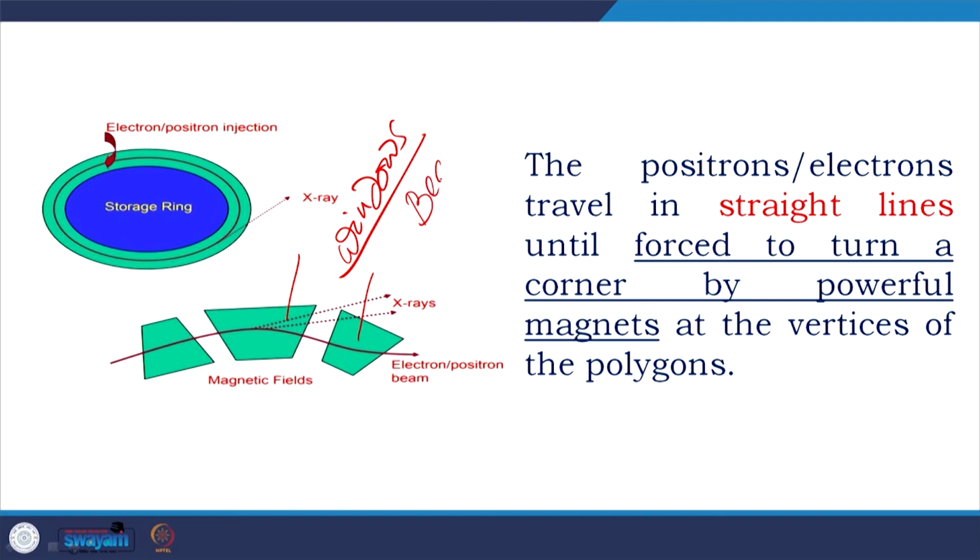In the windows there are beam lines. I was working at Argonne National Lab, APS, where we used to work on a beam line. In every synchrotron they have certain beam lines where crystallographers work; they go there and they collect their data.